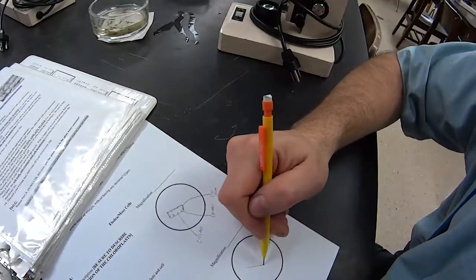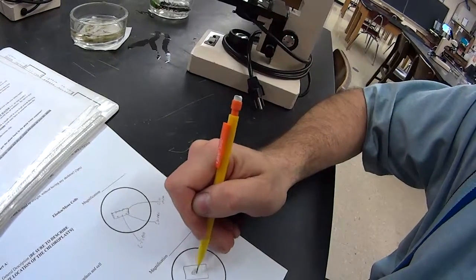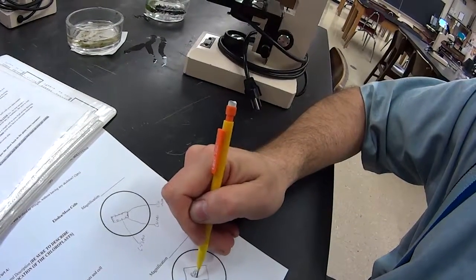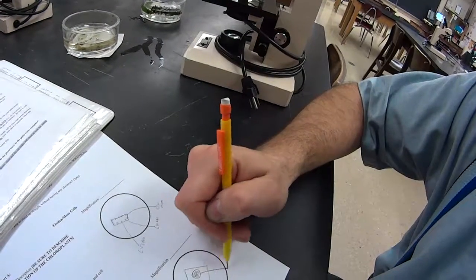Now if you see something like this, and you see all the chloroplasts are crammed into the middle, then that means the cell wall is still where it was before, but the cell membrane now would be here.